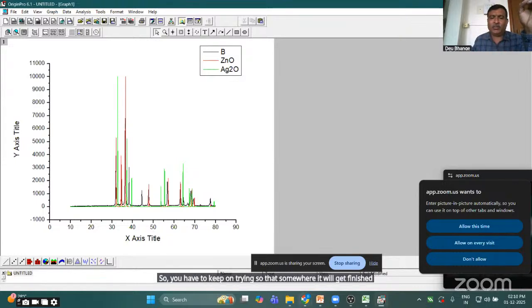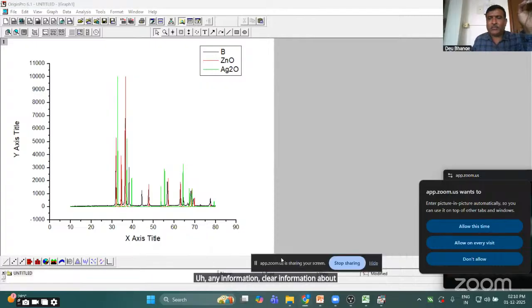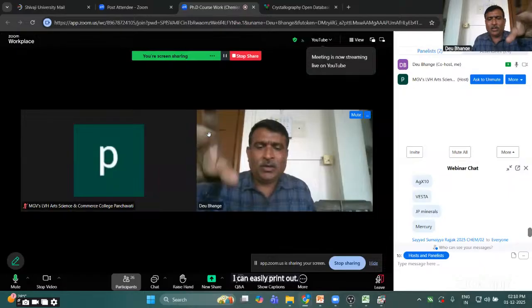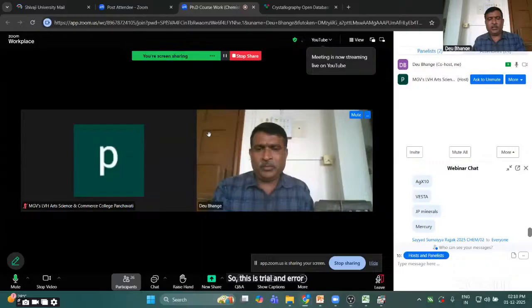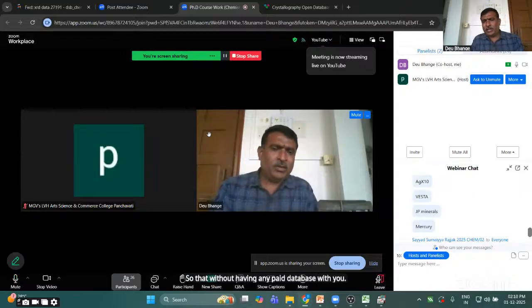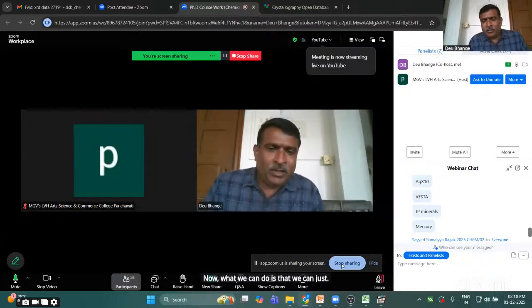So now I don't have any clear information about the synthesis. If I get the information about the synthesis, I can easily find out the other phases in my sample. So this is trial and error, a little bit time consuming, but it will enhance your confidence level. So that without having any paid database with you, you can analyze or identify the compounds present in your sample. Now, what we can do is see the other applications.